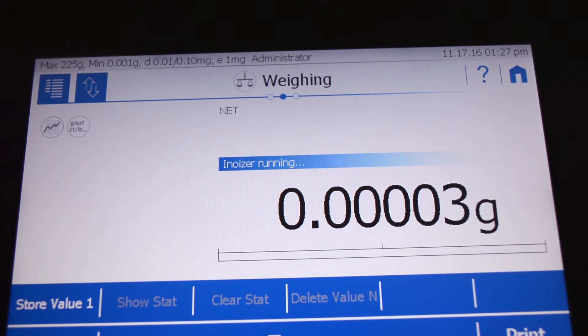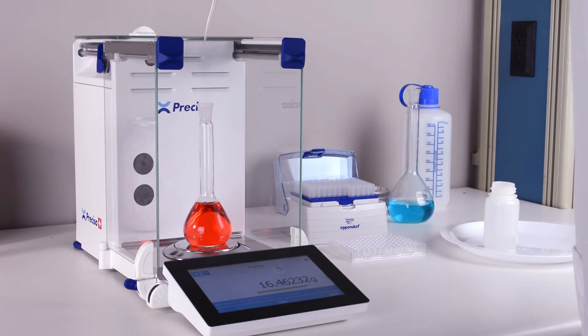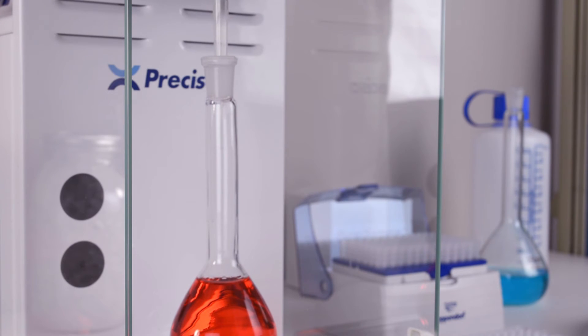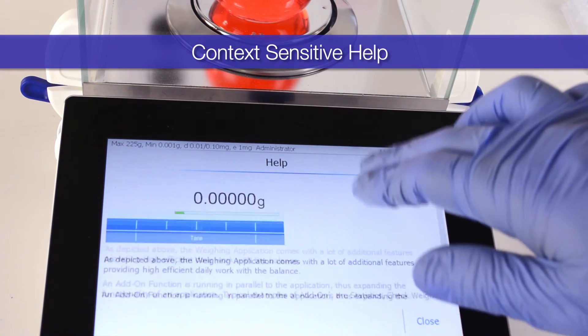If you ever feel you need extra help with understanding the balance's advanced features, you can refer to the context-sensitive help box. It will give you only the instructions you need based on what application or menu you have open.